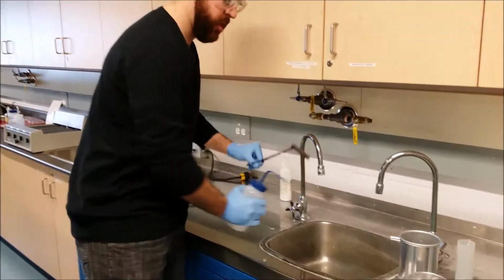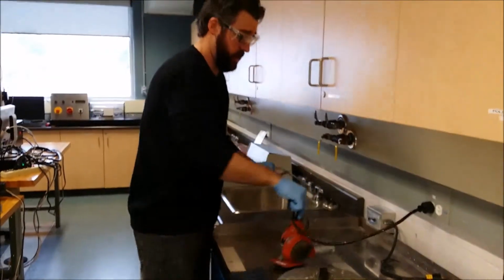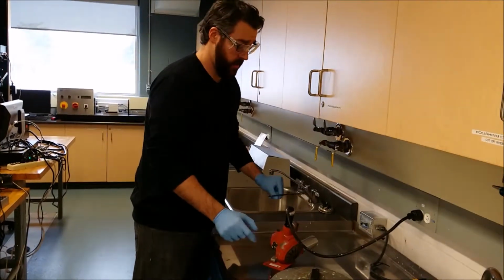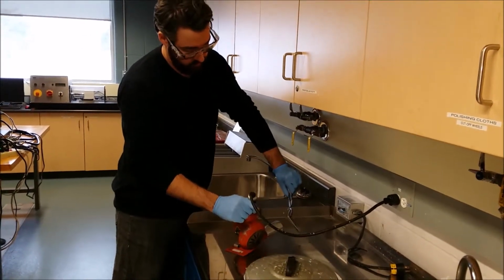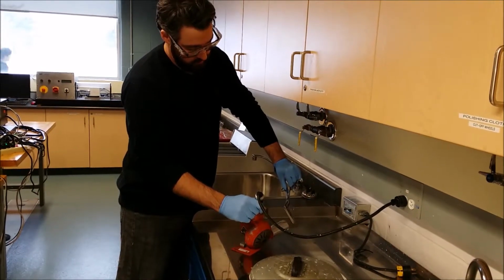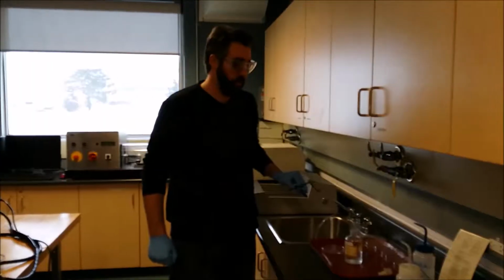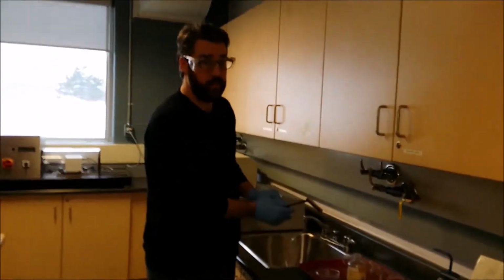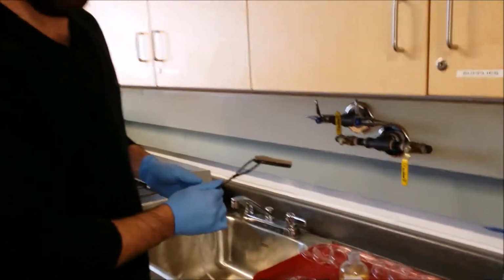Once it's clean, we need to dry it. This is a high watt dryer. You want to use tongs so it doesn't get very hot in your hands. Again. Now that it's dry, as you can see, very shiny, we're going to apply some acid.